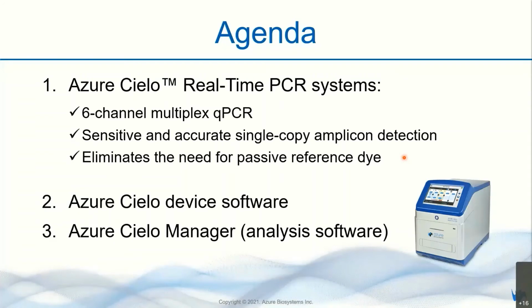And signal detection as well. Next, I'm going to show you how it looks on the Cielo device software. That means the software used on this machine and also the analysis software that we use on a PC.